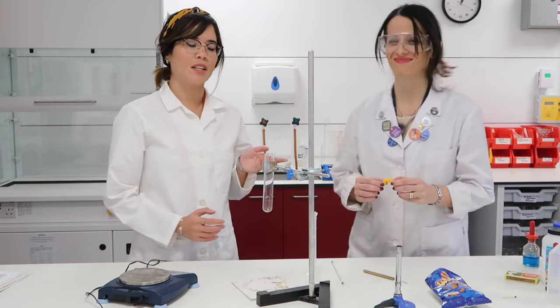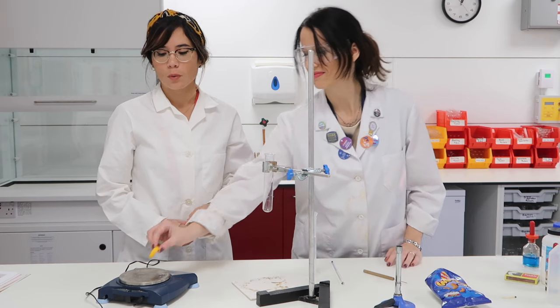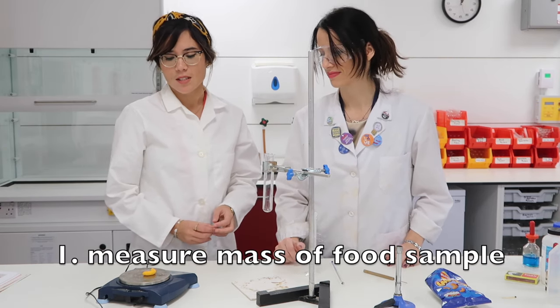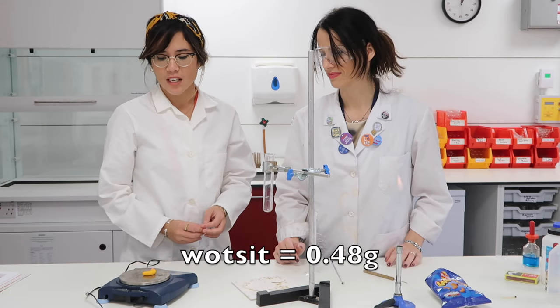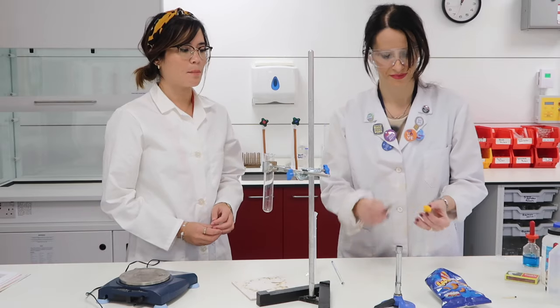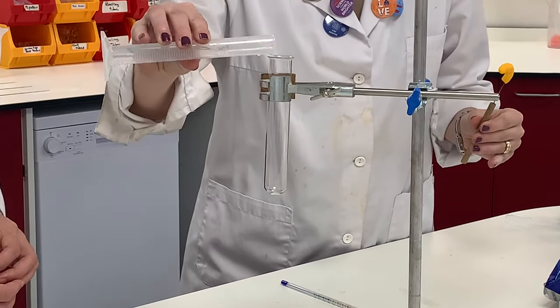Now let's first of all pick the food we're measuring the energy content of. We're not being very original here — we've simply got a Wotsit. So your first step is to measure the mass of the Wotsit using a measuring balance, and this Wotsit is coming out as being 0.48 grams.